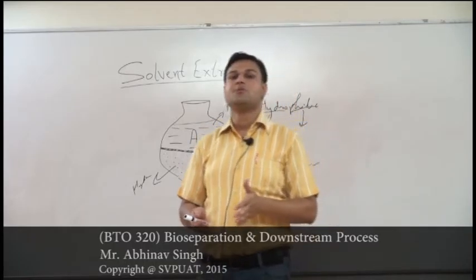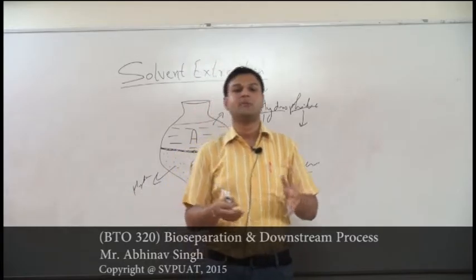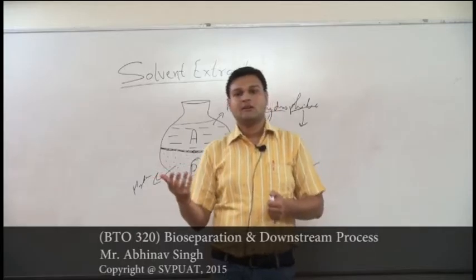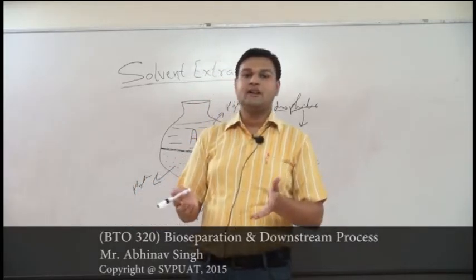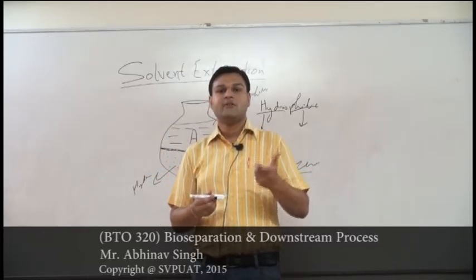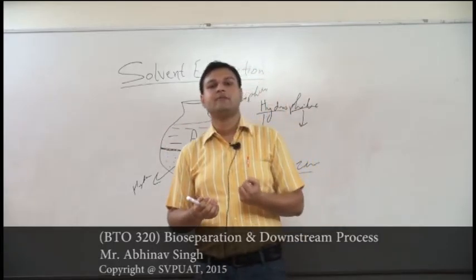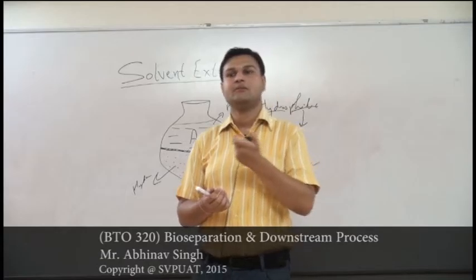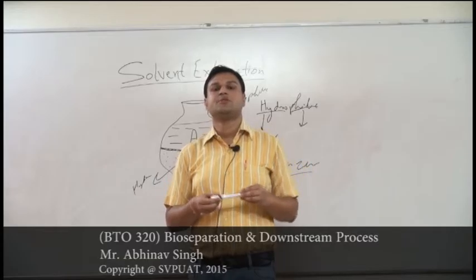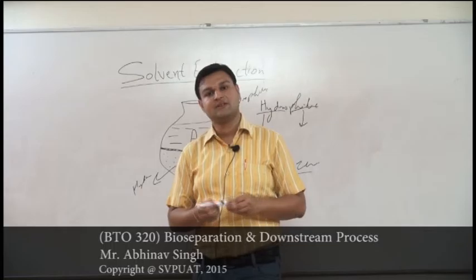It also reacts in the same way, and once it has taken the product of our interest out of the matrix, we can directly reduce the temperature or bring the pressure back to normal, and ultimately the carbon dioxide will transit from its liquid state into the gaseous state. What is the benefit? Carbon dioxide is directly liberated into the environment, and what we have with us is the ultimate purified product that we required. So this is the objective of using these two variants of this primitive technique, that is, solvent extraction. So that is all.